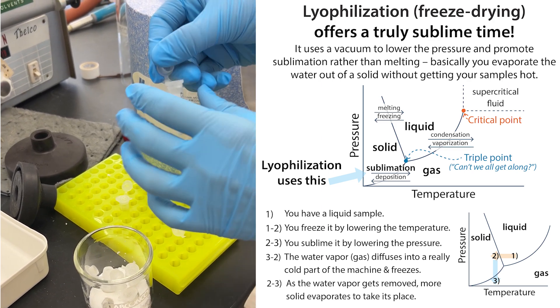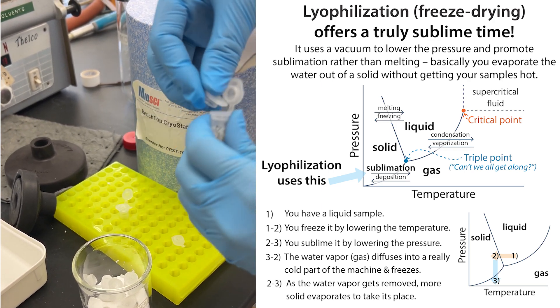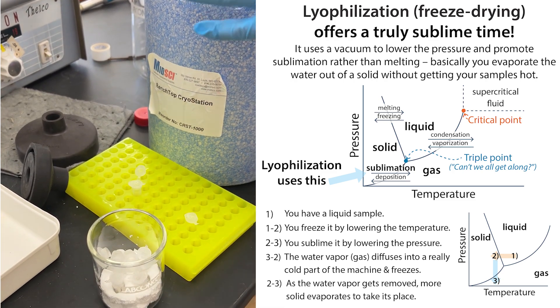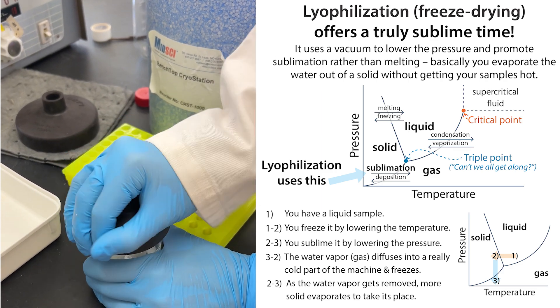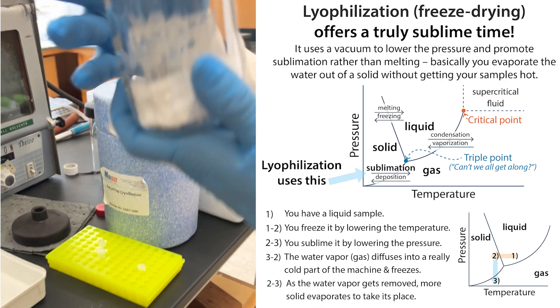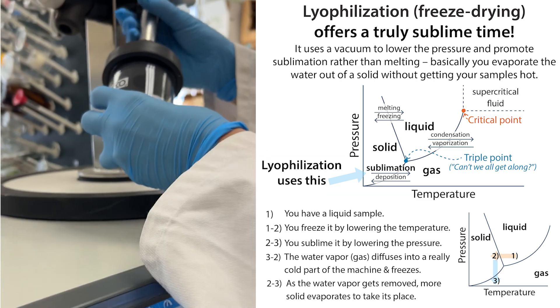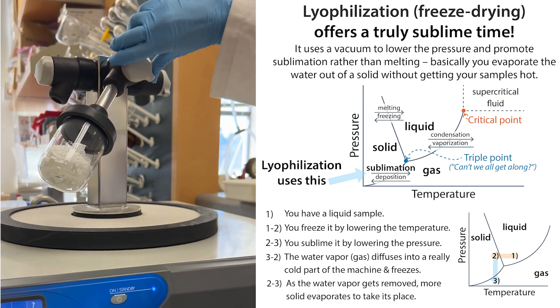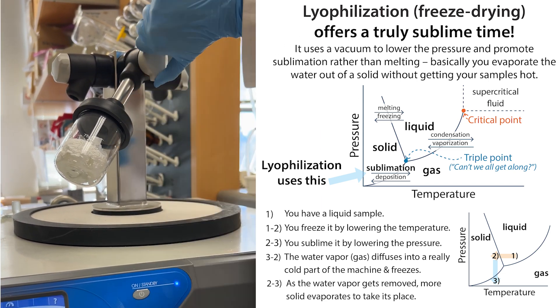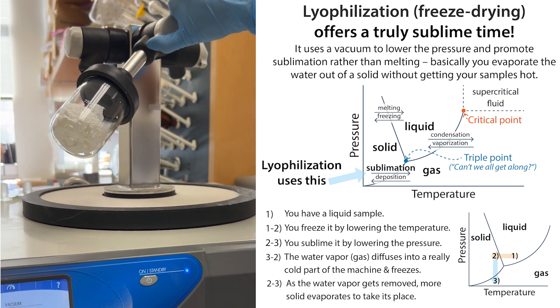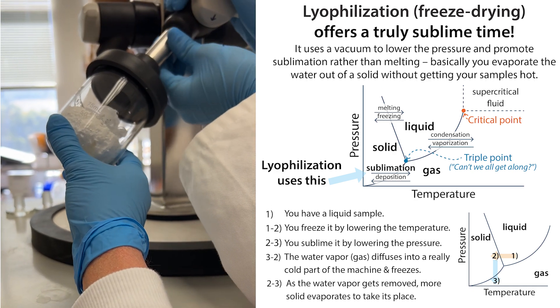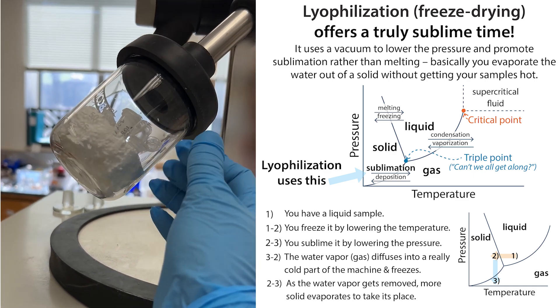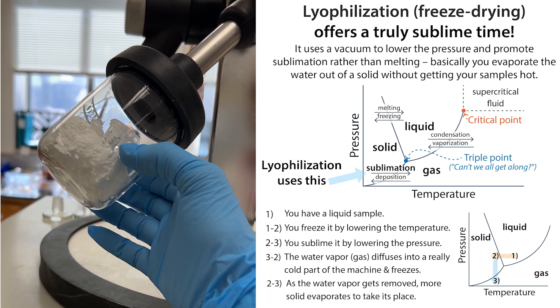This way we'll be able to do the derivatization step directly in these small tubes, which avoids having trouble pipetting those 40 microliters out of the big tube. Hayley puts it up there and opens the vacuum — and now the pressure in here is going to go down, down, down.